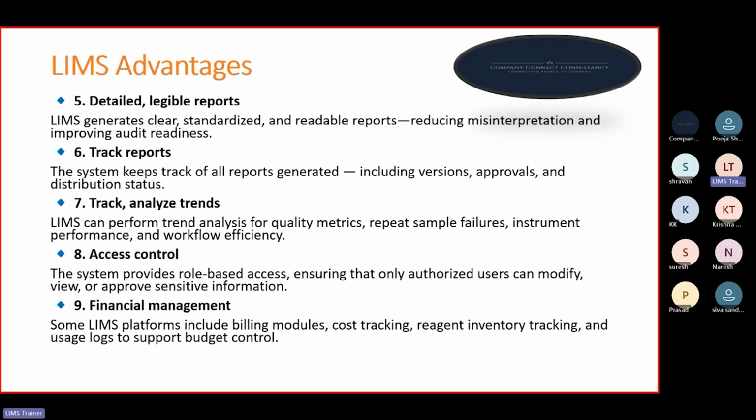Super user will have all the access. So this is the hierarchy maintained in the system, so nobody can just go there and delete any entries. The role is defined, and the access of that role will be allowed to authorized persons only. So that access control is provided by the LIMS.